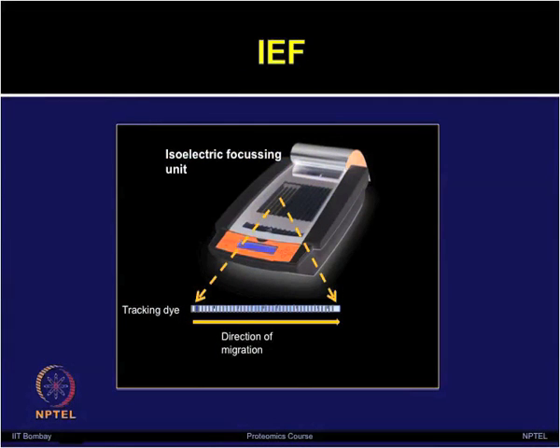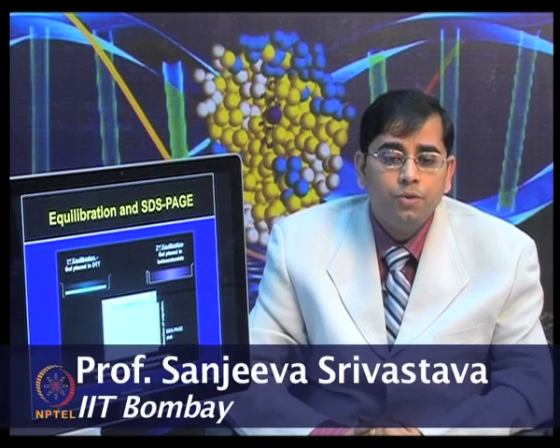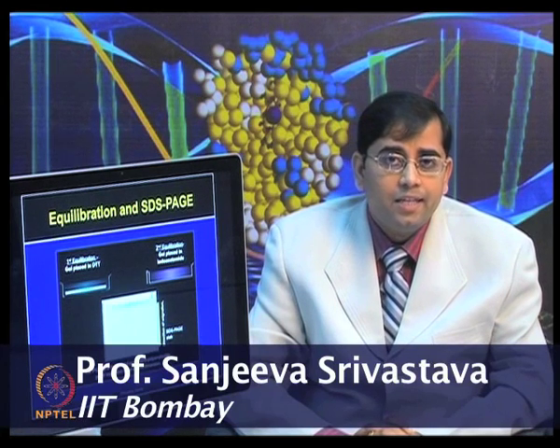It is a good idea to avoid any light exposure during the rehydration, dye reconstitution process as well as while the isoelectric focusing run is in progress.